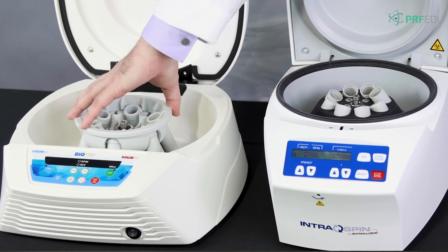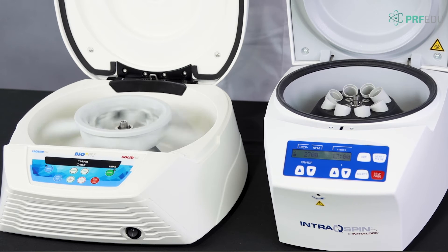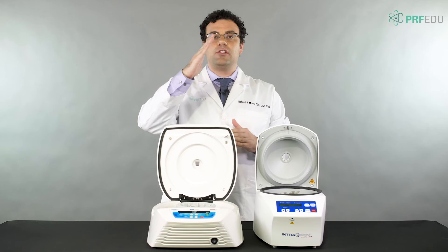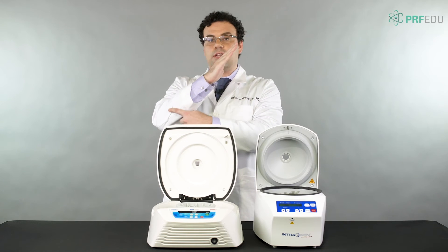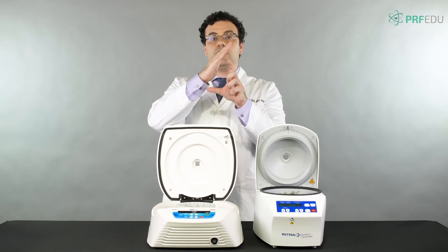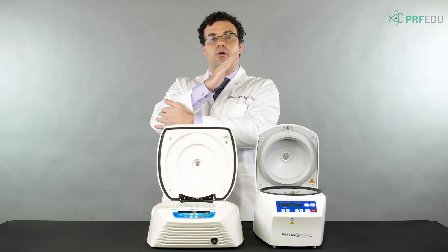If we do a quick demo here and spin this, you can see the tubes swinging out horizontally. As covered in chapters two and three, in a fixed angle centrifuge, platelets at the bottom have to climb all the way up to the top of the tube, and much of that happens at the back walls.